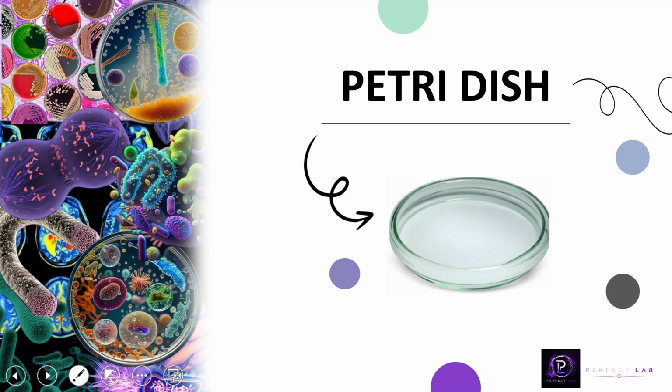And in today's video, we are going to learn about the Petri dish, which is one of the most commonly used laboratory ware for growing and observing microorganisms in the lab. I will also introduce you to the different types of Petri dishes, explain their key features, and discuss the advantages of each type. So let's get started.